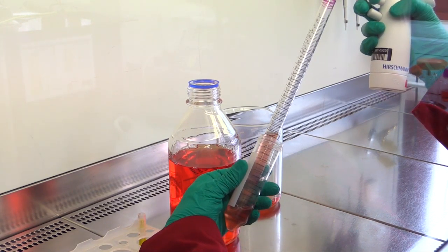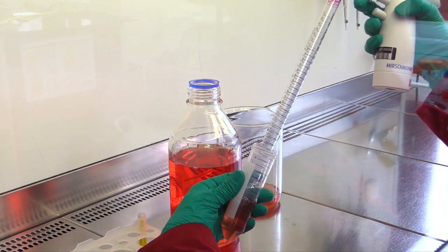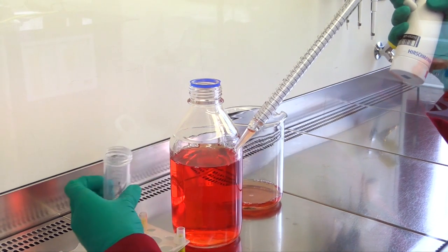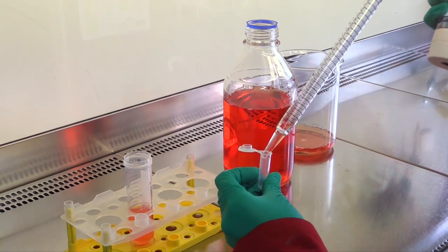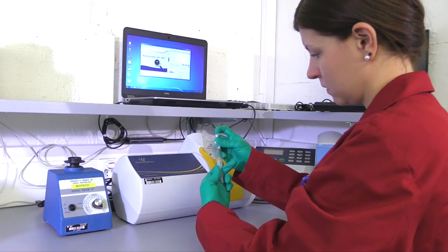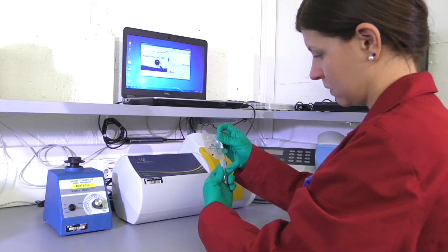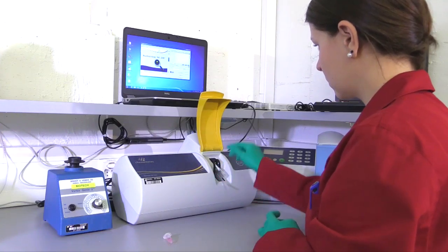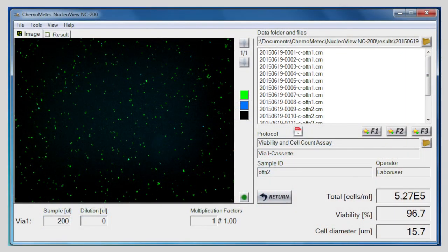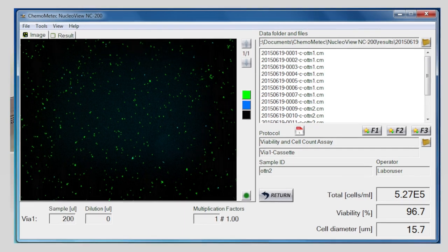A sample is taken from the well-mixed cell suspension in order to determine the cell density and viability. The cell counting is performed using the automated cell counting device, Nucleocounter. Afterwards, inoculation volume is calculated. In our case, to achieve sufficient cell growth, it is important to have around 3 times 10 to the power of 3 cells per centimeter square carrier surface and a cell viability above 95%.